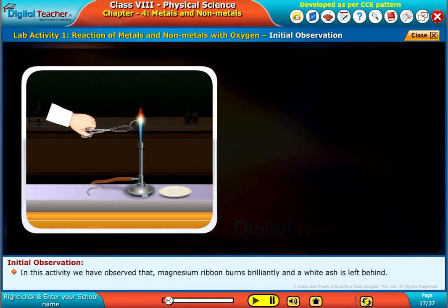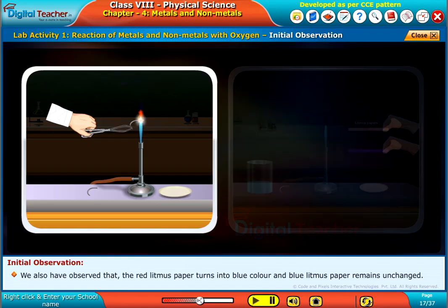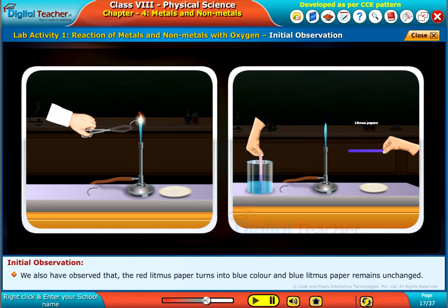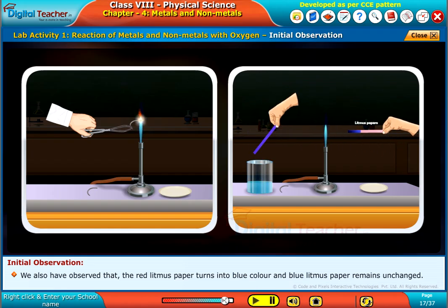In this activity, we have observed that magnesium ribbon burns brilliantly and a white ash is left behind. We also observed that red litmus paper turns blue and blue litmus paper remains unchanged.